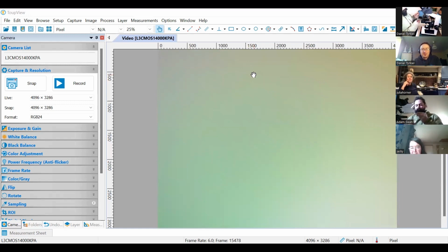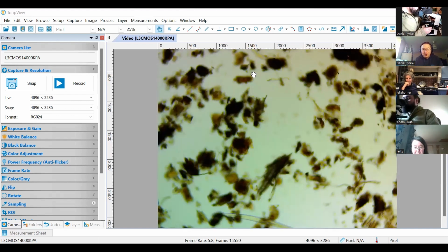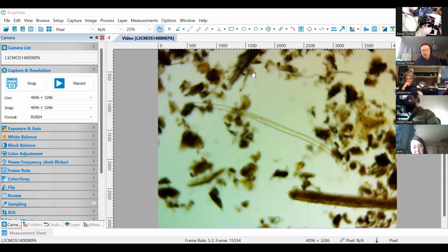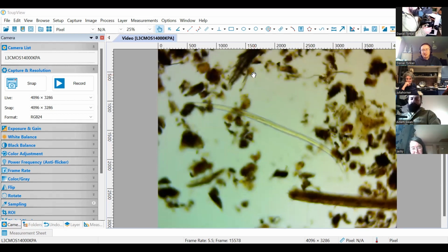So he's basically showing that if the conditions are changing, the nematodes can go, okay, well, I'm just going to stand still. Now, if you do this wrong, like I do most of the time, it goes badly; see, this time Adam was successful. The nematode just slowed down and it's just sitting there not doing anything. It doesn't look like it's damaged.